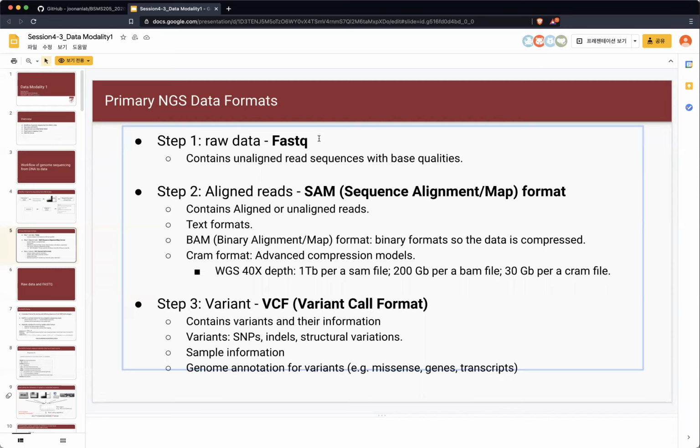So in that case, they again use binary information to enhance the speed and efficiency of certain tasks, right? So in sequencing programs too, we use the binary format rather than the SAM file, because it's much quicker, much more efficient, and works specifically on a certain task. And binary information is also much more compressed, right? If you store your sequence information in text format, that will require a large amount of disk space, right?